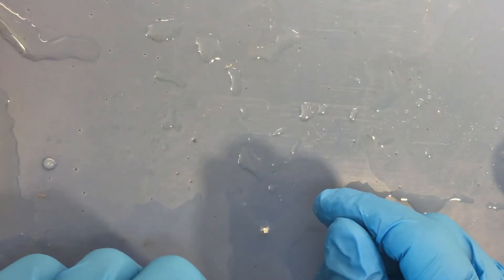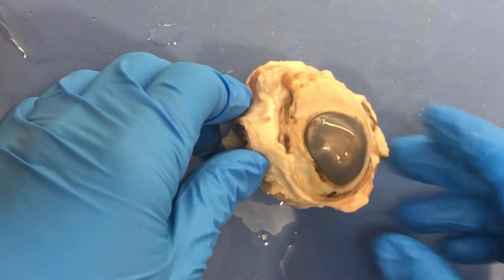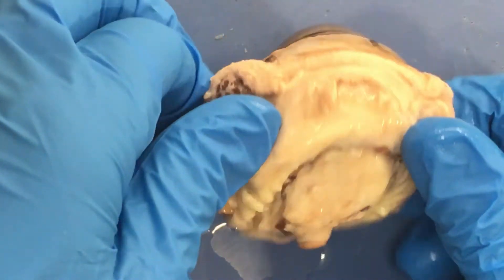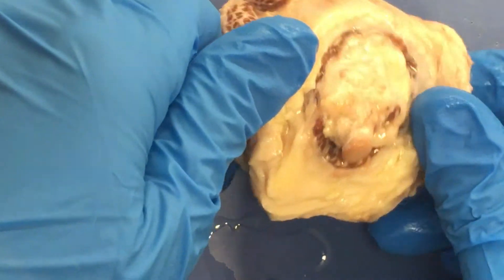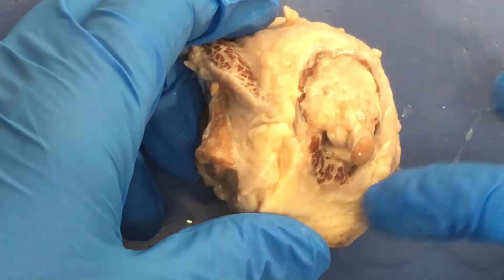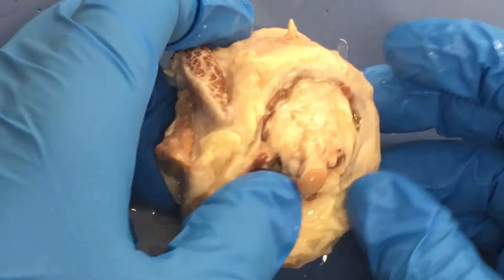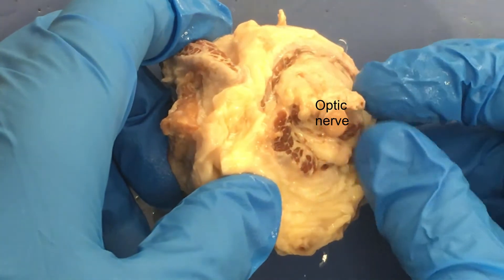This is going to be our last dissection video, and for challenge I'm going to try to do it all in one take. It's the eyeball — I'm going to dissect it in front of you. There's the eyeball, and taking a look at this, you can kind of tell the front and the back. There's some external anatomy we can see. I removed a bit of eye muscle beforehand, so there are little remnants of it — that brownish, reddish stuff. And you can see this very obvious stub sticking out here, which is the optic nerve.